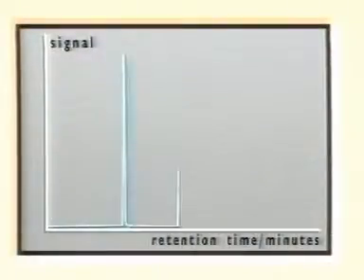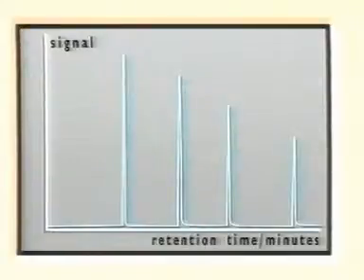Each peak on the chromatogram represents a component in the mixture that has been separated in the capillary tube and detected in the flame.